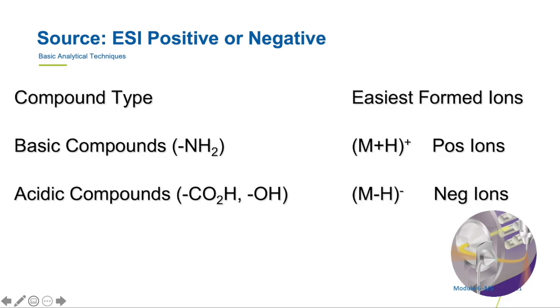This is an important advantage in food safety, where we are often working to quantify large numbers of contaminants at once, and it enables more compounds to be included in the same method. In other words, we obtain more results for the same analysis, which saves time and money.